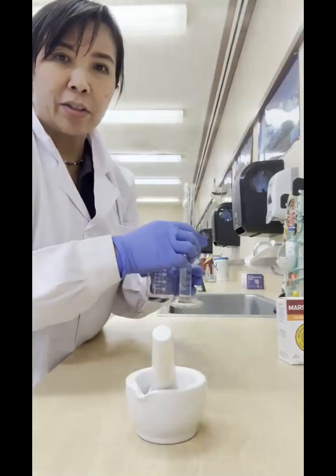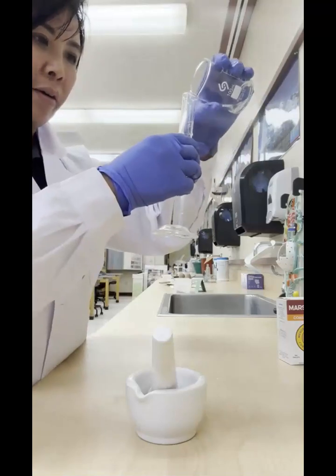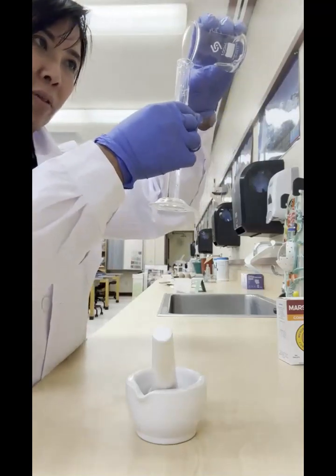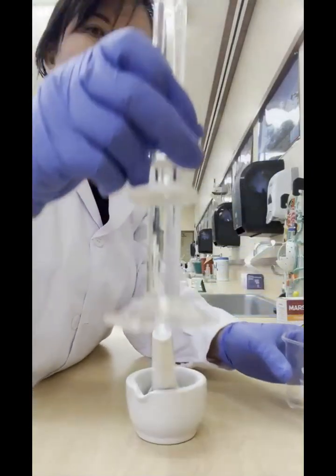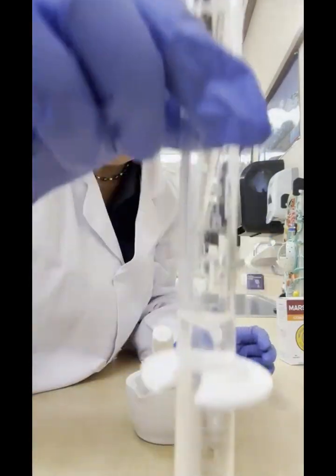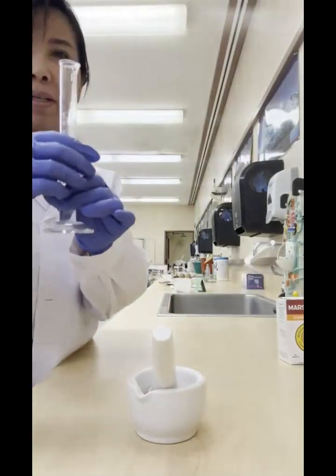Now using a graduated cylinder, we're going to get 15 milliliters of water. So let me just finish filling this up. This is the 15 mark here, right? So we're getting 15. It's a little bit over, but that's fine.